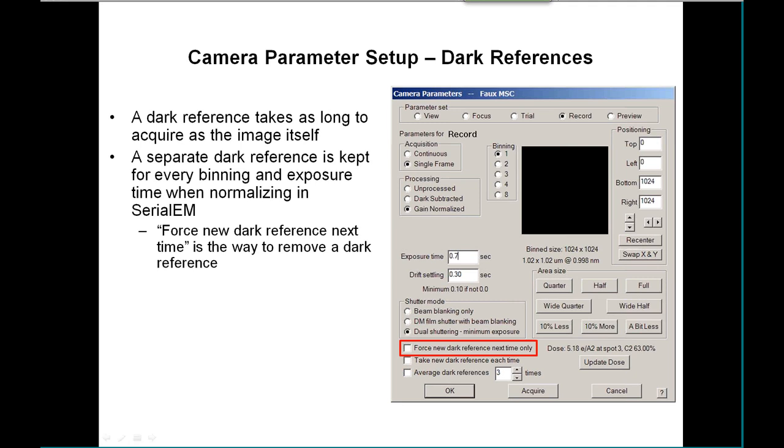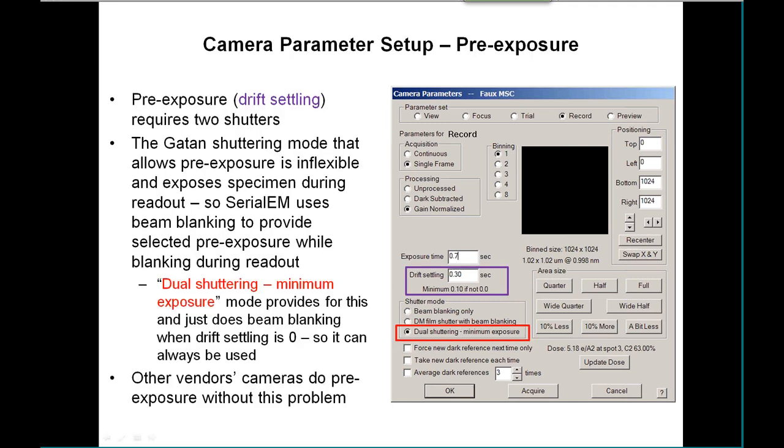When you have the program set up so that it normalizes images in SerialEM, it keeps track of dark references and can keep a separate one for every binning and exposure time that you've been using up to a certain point. The oldest ones will be thrown away as it runs out of memory. The way to get rid of dark references is to use this 'force new dark reference next time' option.